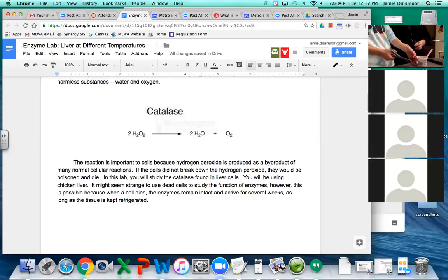And then another job that people can have that's less gross is being in charge of temperature. That's fun, getting to use the thermometers. Is this too big? I think it's good. Okay, but be very careful because they all have the same glass size. Dude, this is cold. It's making my hands freeze, guys. Okay. One more.